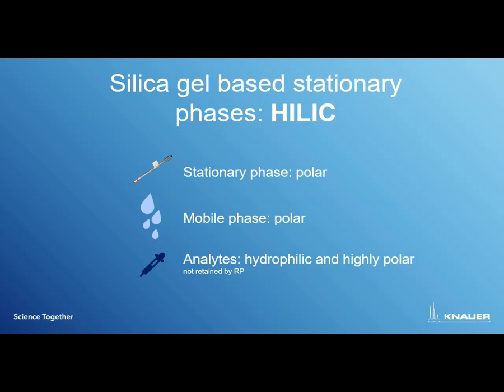So what you do here is use a mobile phase that consists of water and a modifier, like in reversed phase mode, really. And the trick is that you build up an aqueous layer between the stationary phase and the mobile phase. So most of the interaction of the analytes is not between the stationary phase itself and the analyte, but between this aqueous layer and the analyte. And therewith you can use exactly the same stationary phases as in normal phase, but now in the HILIC mode.